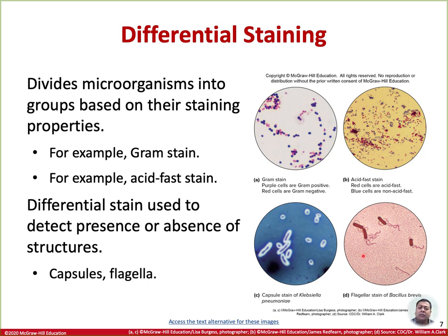On the other hand, to visualize these flagella under the bright field microscope, we can increase their thickness by coating them with mordants or helpers, such as tannic acid or potassium alum. So we use the tannic acid or potassium alum, and then staining with a dye such as basic fuchsin will allow the visualization of these flagella.